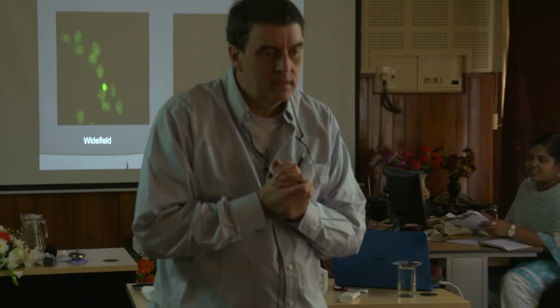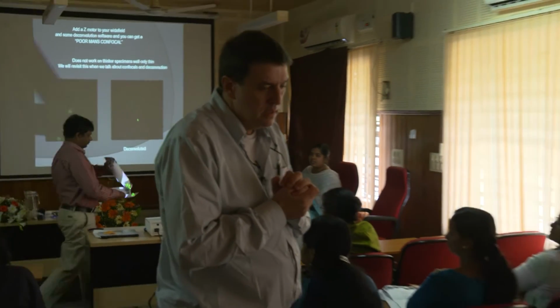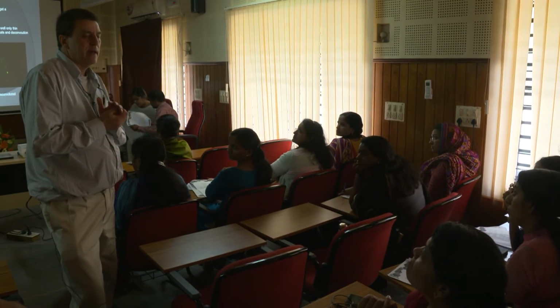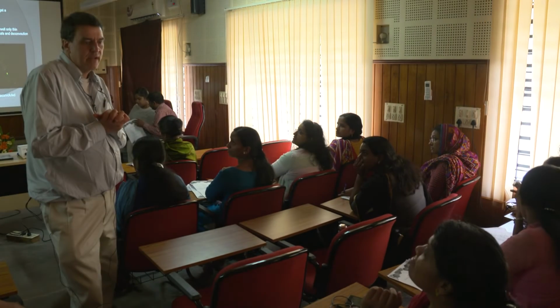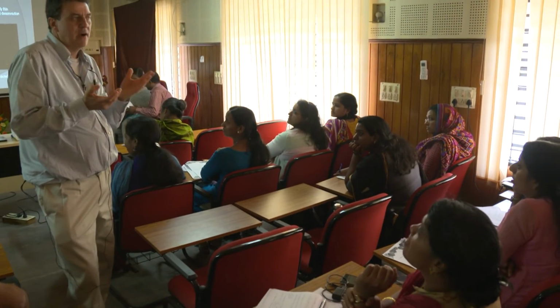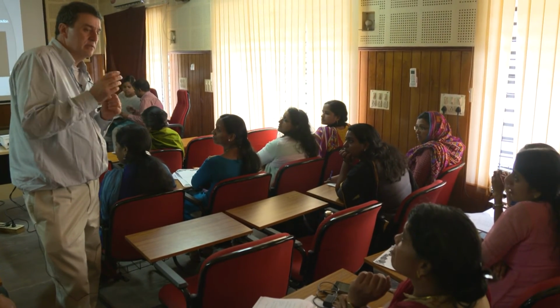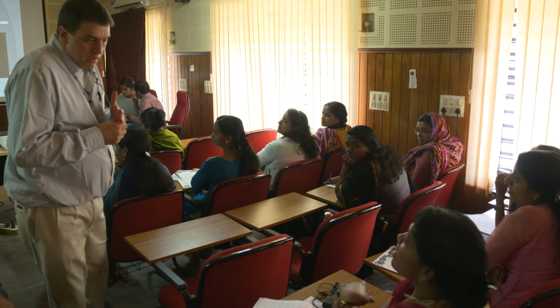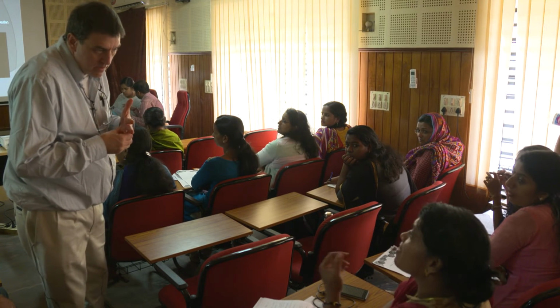What was that? Alexa 488 dye, it's costly? Costly? I wouldn't say that. I wouldn't say it's any more costly than any other dye. It's not outrageous or anything. But the good thing about it is it'll last, and it's a good solid dye. Yeah, and in that case we can reuse it.